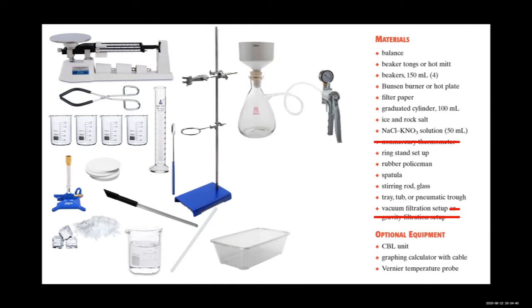setup. In this case, we used a vacuum filtration setup. In place of a non-mercury thermometer, we will be using the CBL unit. We did not use the graphing calculator. The Vernier temperature probe goes along with the CBL unit.